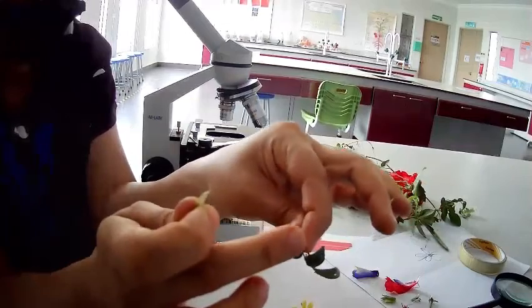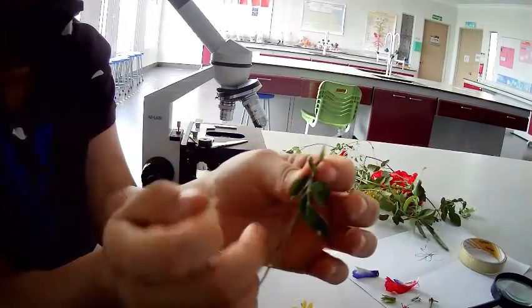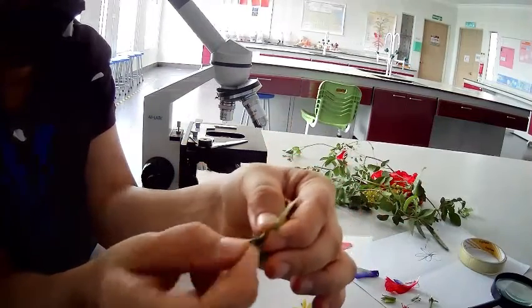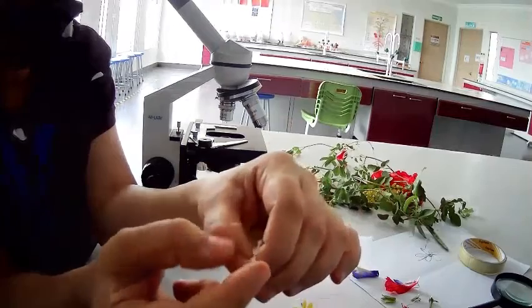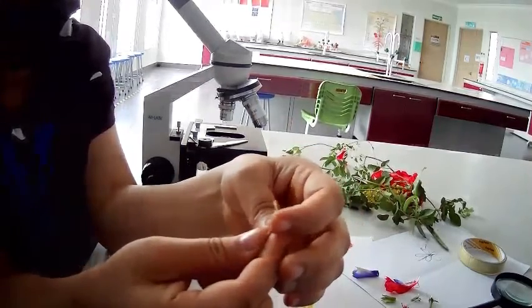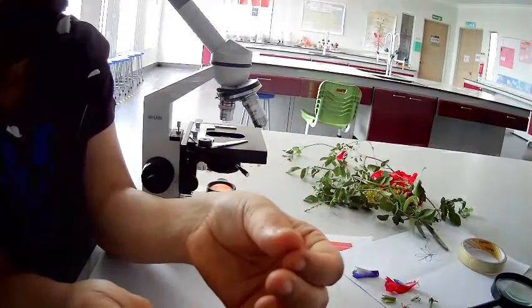So this is the stigma, the female, which is the longest part, and it's connected to the ovary at the end. It's like a bulb-like structure, rounded, bigger, swollen, and it's surrounded by a lot of anthers. A lot of male parts, and the anthers contain these pollen grains. It attaches on my skin. They have like a yellowish powder.